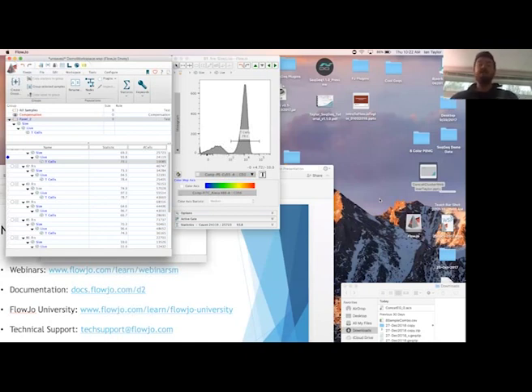The downsample option is actually a little bit nicer than the include no more than, because include no more than means it will include events in the FCS file according to their acquisition time. So you're slightly biasing your data set towards those events collected first. There's probably no reason why that would hurt, but it would be better to take a random sampling, which is essentially what the downsample tool will do. But again, a really great question there.